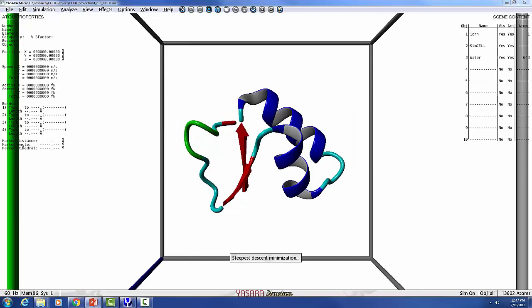analyzing this protein. All right, and so this is a process that will take quite some time. It may take days or it may take weeks to analyze a protein depending on its structure and complexity. So you would run this and let it go, and it'll run different steps of this code. So don't try to move things around because that changes how things work here.